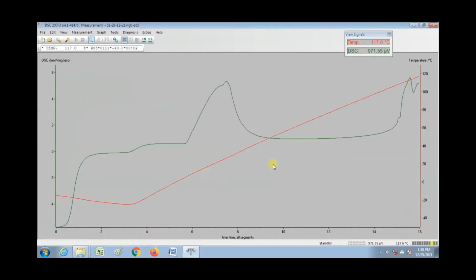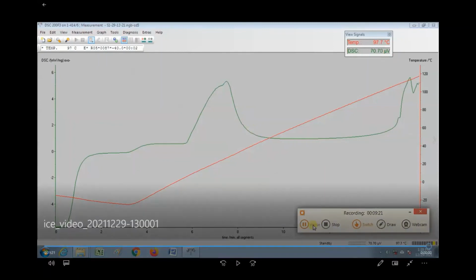Finally, the plot which we have got for our heating shows two peaks, one major peak and one minor peak. The major and minor peaks are always calculated through their onset values, through the peak, and through the offset value, where basically the peak ends. Apart from that, we also calculate the surface area under these peaks. So this is the information that we get from the DSC curves, and the rest of the things we have discussed in the tutorial already. Thank you.